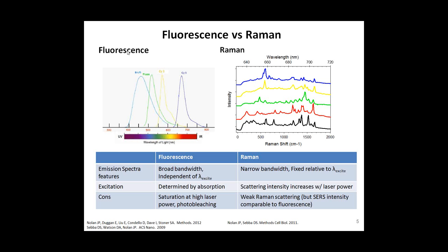Usually with a well-designed microscopy system, you can have 4 channels, listed here, as you can see from the DAPI, GFP, Cy3, and Cy5. This is largely because of the fluorescence itself. It's a broad bandwidth, so you can't afford more than 4, I would say. If you carefully design it, maybe we can have something like 6 or 7 channels at a time, but it can't go more than that.